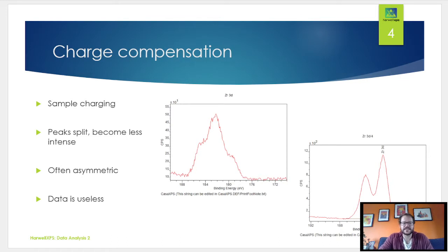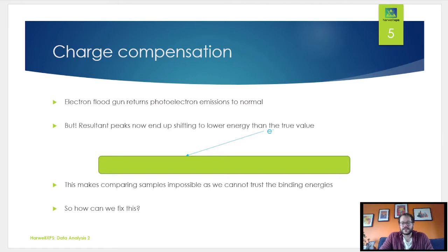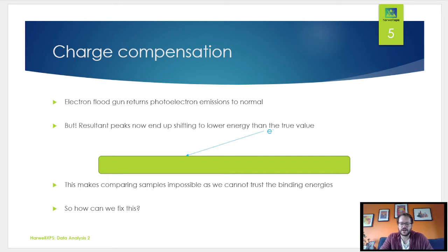A couple of examples here: some zirconia ZrO2 with and without a charge compensation system. On the left you can see a broad mess with not much usable information, whereas when we use the charge compensation system on the right, we get the nice well-defined doublets we would expect from bulk ZrO2. So how we achieve this on an instrument level is to use an electron flood gun.